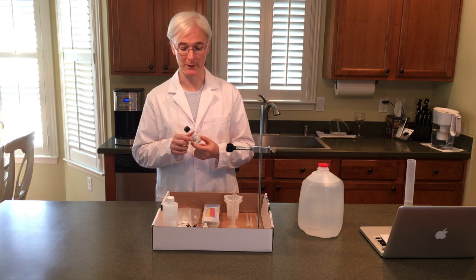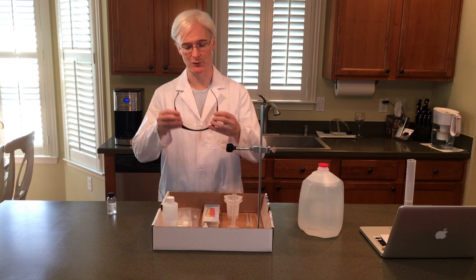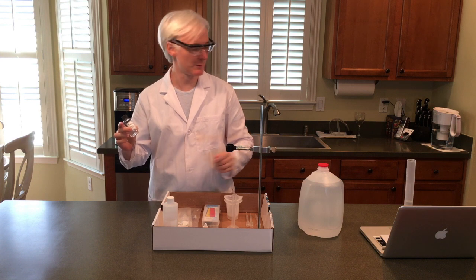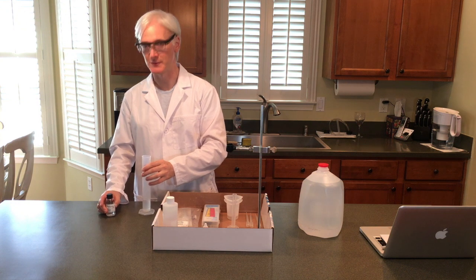So before we get going, I've got the lab coat on so you should have your apron on. Safety goggles. We have the concentrated 0.2 sodium hydroxide, and here we have 30 milliliters of distilled water.